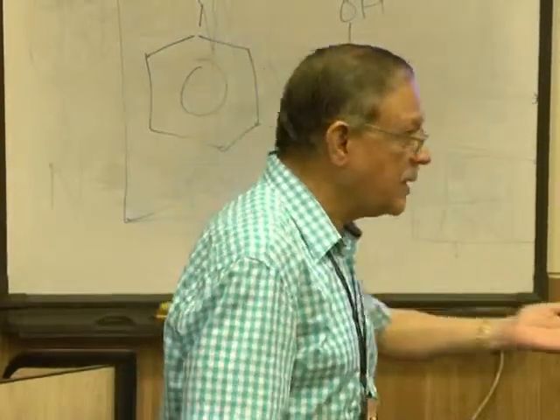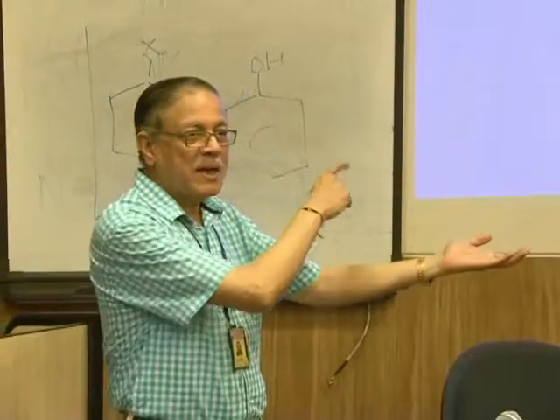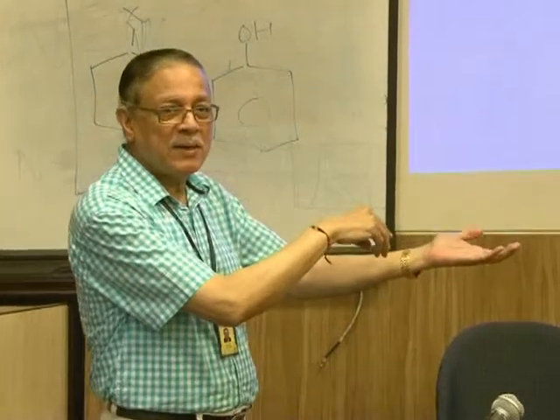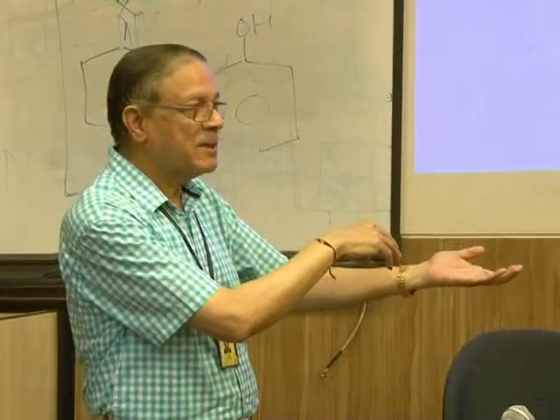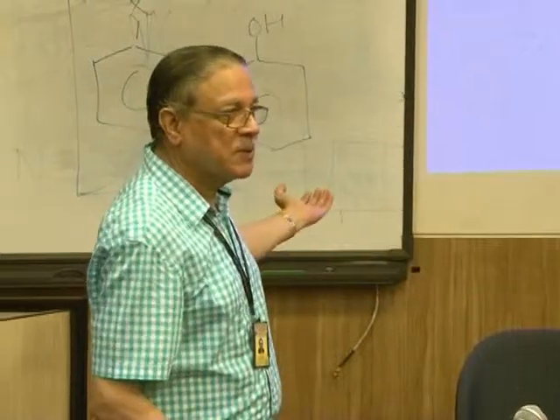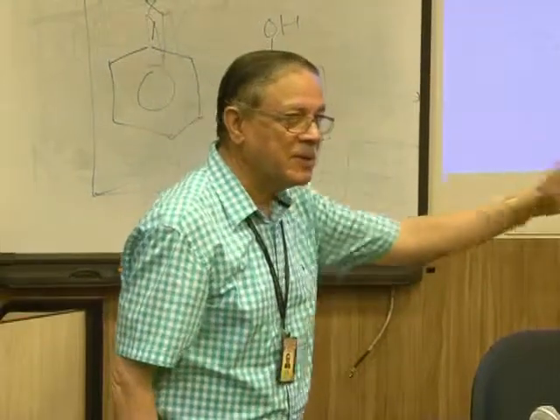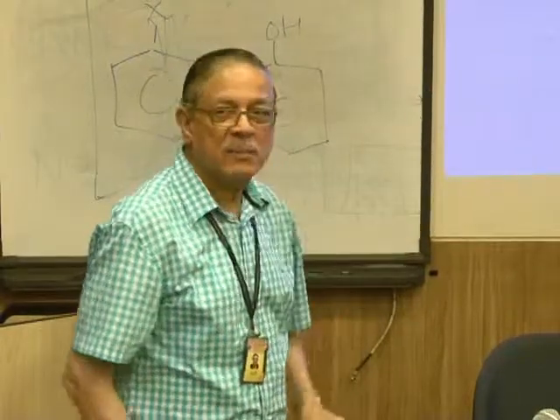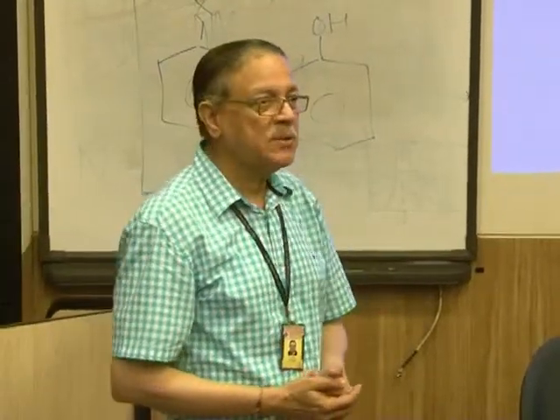So with the stationary phase, there is hydrogen bonding of the second solute. As a result, it is retained by the stationary phase for a longer period of time compared to the first solute. So the first solute is eluted first, and then the hydrogen bonding is broken subsequently by the flowing carrier gas, and then the second solute comes in.